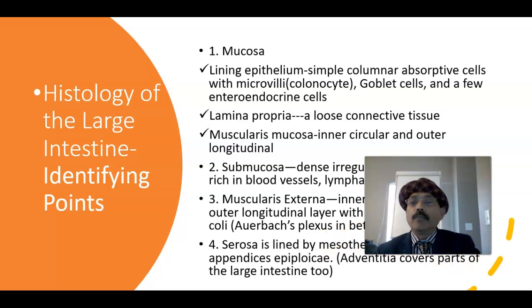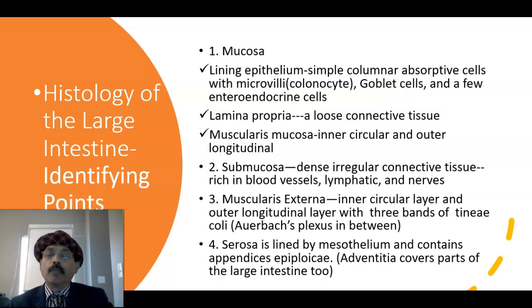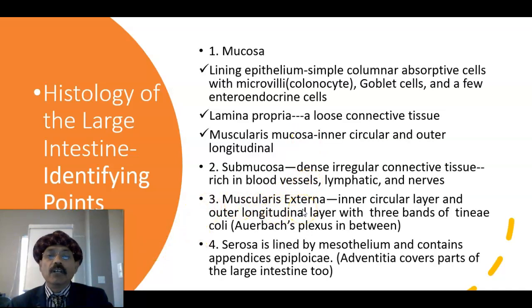So these are the identifying points you have to note. Lining epithelium: we have plenty of goblet cells, and the number of goblet cells increases in the lower part of the large intestine. As a whole, goblet cell number is more than that of the small intestine. We have a few enteroendocrine cells. We have the columnar absorptive cell, also called colonocytes. Then lamina propria, muscularis mucosa, submucosa, muscularis externa. We have the parasympathetic nerve plexus between the muscle, called the myenteric plexus or Auerbach's plexus. This is a derivative from the neural crest cell, and it is essential for the peristaltic movement.